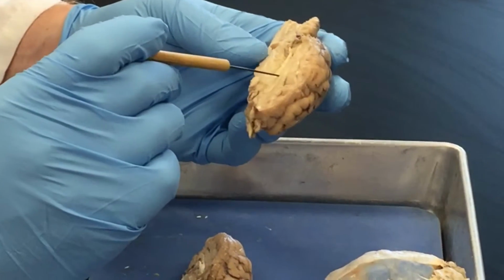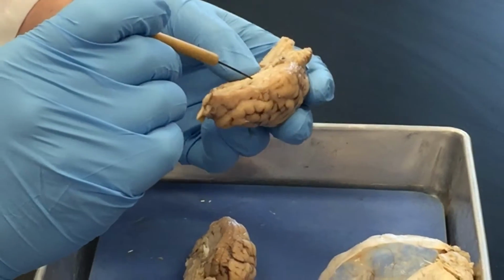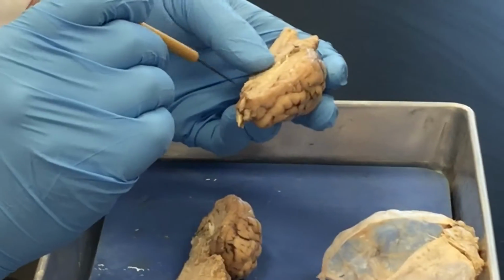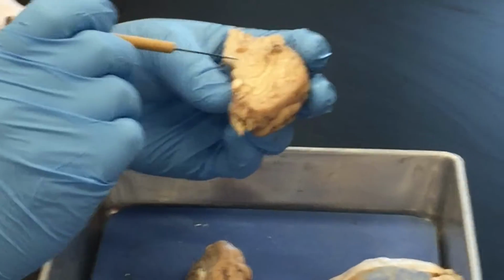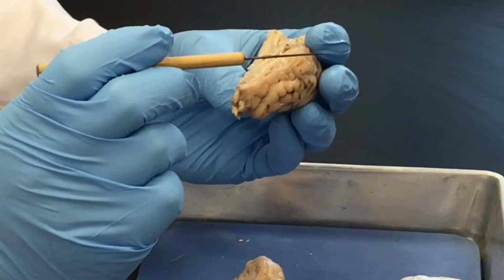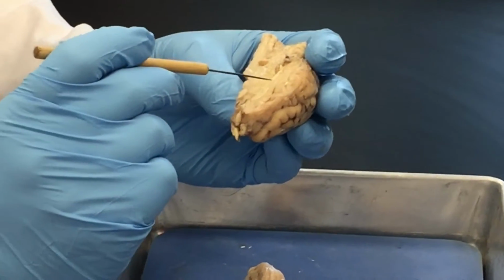Now underneath the corpus callosum, see the space in here? That's the lateral ventricle. Open that up a little bit. That's where the cerebral spinal fluid lives. Okay? So tough to see the different parts of the brainstem from in here, but if I flip it, you can see medulla, pons, midbrain, spinal cord. We just need to be able to identify the lateral ventricle in the sheep brain. The lateral ventricle is the only ventricle you need.